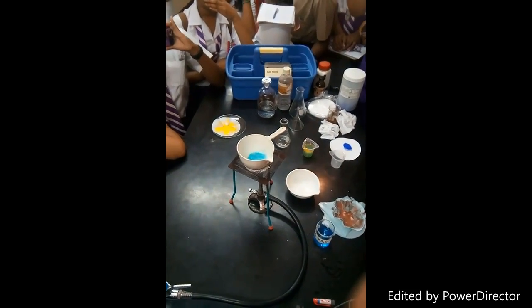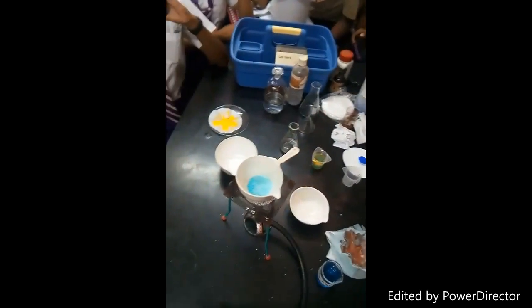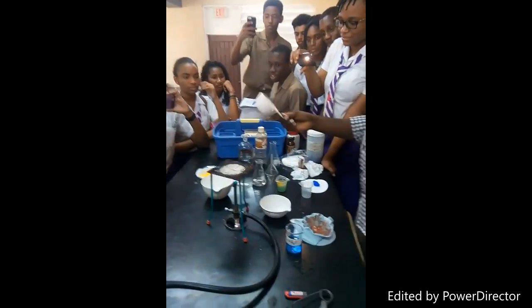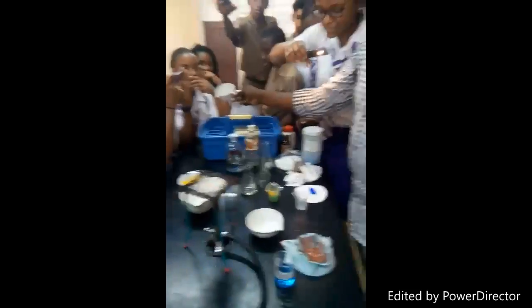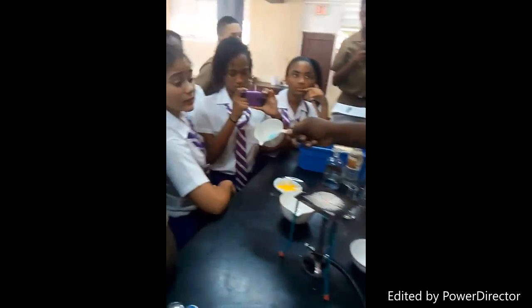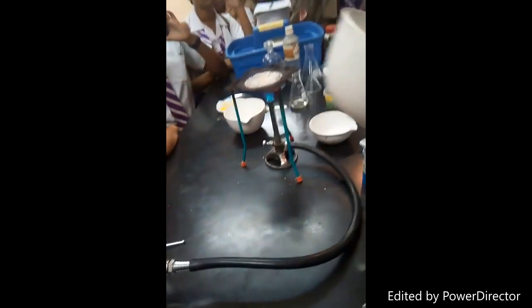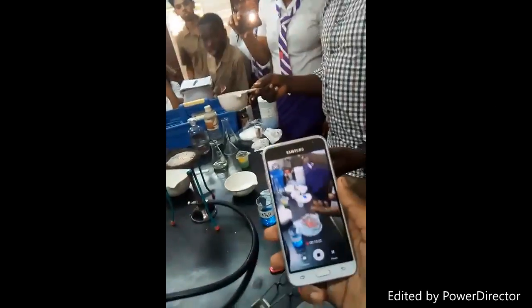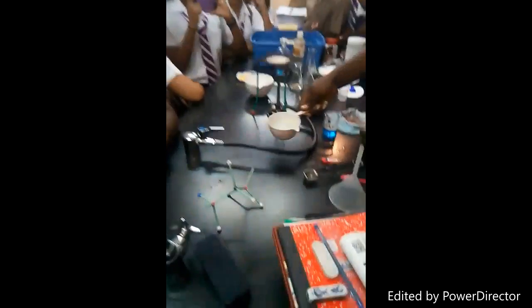Full dryness, sir. It's dry. Alright, so now, when it's dry, without the water, this is what it looks like. I compared that to this thing there. Without the water, you don't want it to look like that. If you put water in there, it will get back the water and you can leave it on the table. But the point I'm making is, since it contains water of crystallization, you cannot boil it to dry. Wow, it looked like detergent.